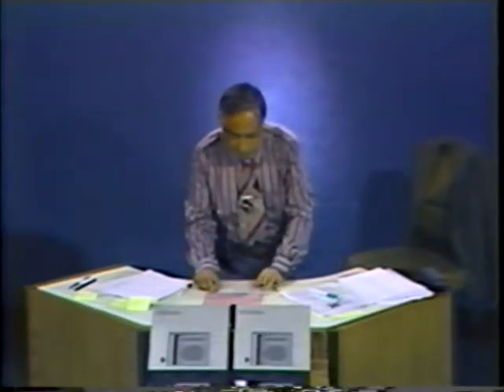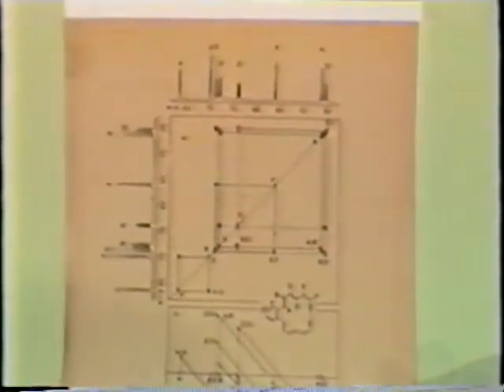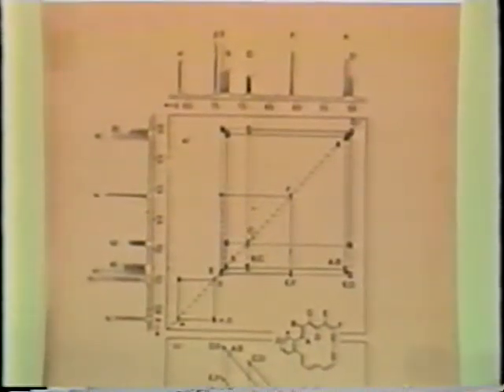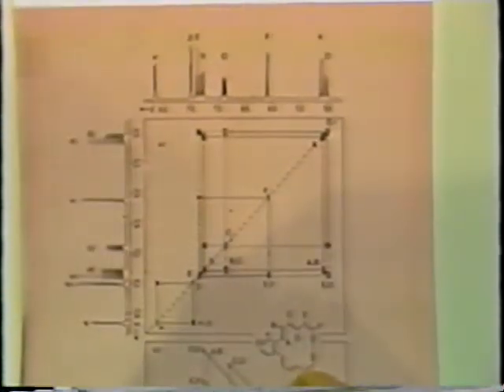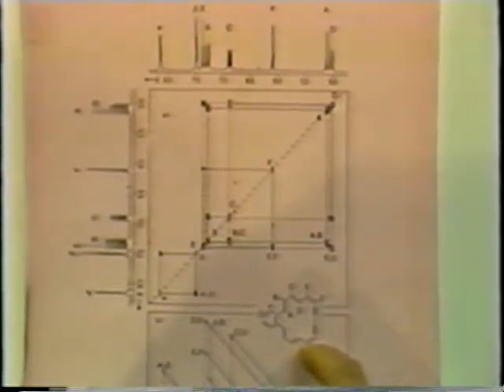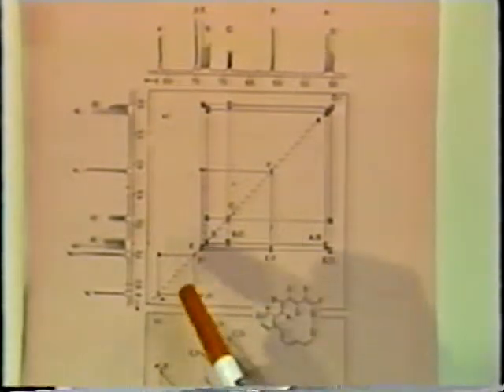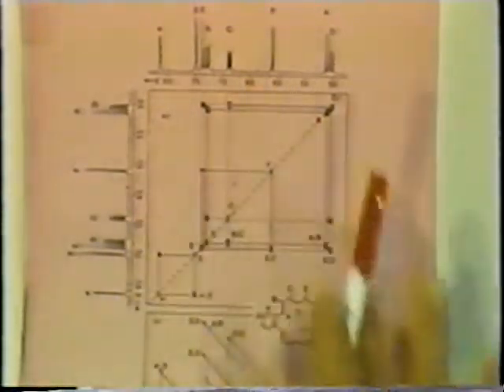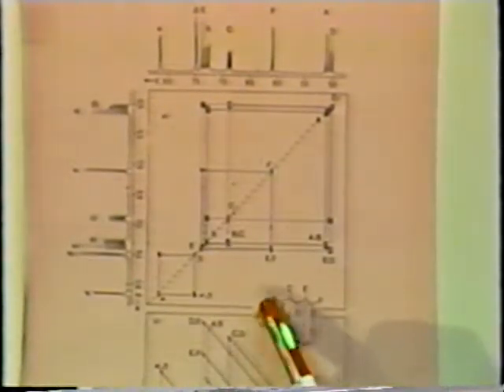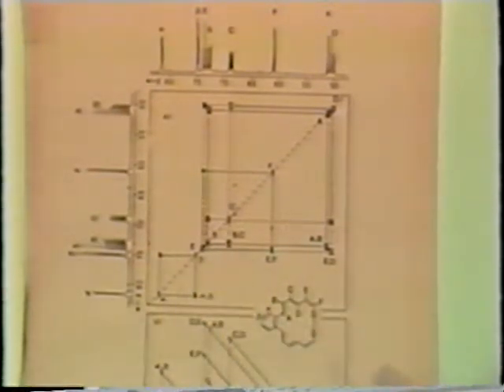A slightly more complicated spectrum will look something like this. That is the one-dimensional spectrum, and again the question is, which line belongs to which proton in this molecule? Run a COSY, and you see the result. The first thing that you notice in the COSY is there are two lines which are mutually coupled and not coupled to anything else. So they must belong to this separated ring, and so these are the alpha and the beta protons.